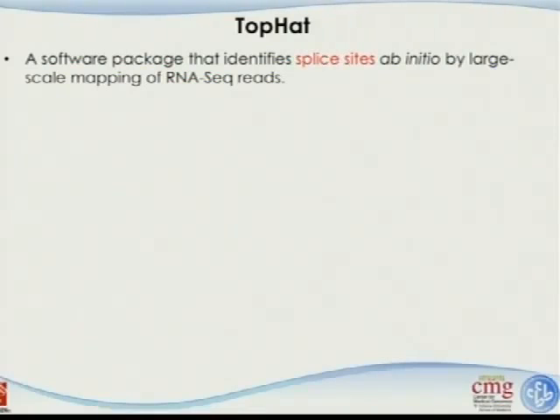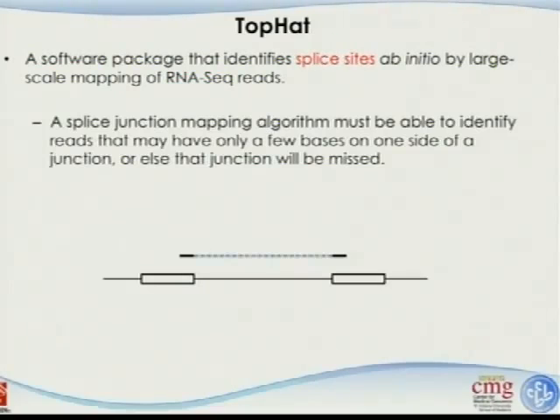The second reason is it has some upstream and downstream tools that are connected to TopHat very well. So some other algorithms for downstream analysis, for example, isoform identification, were based on the assumption that your alignment was done by TopHat, and then the applications become much wider.